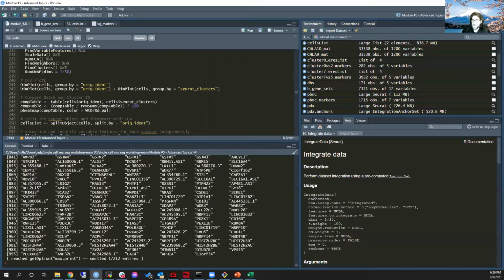Okay, if not, I'll just say, and then we can jump into the answers. Yeah, features. So features are different, except they're actually not. The same features are in both original data sets. So it's not the original data sets' features that are the problem here. I know because I ran them through Cell Ranger at the exact same time.